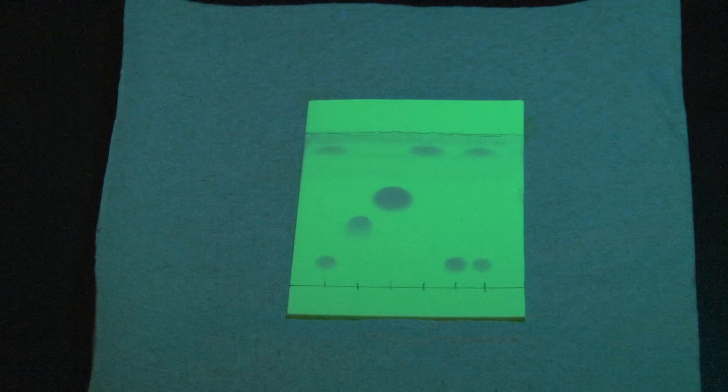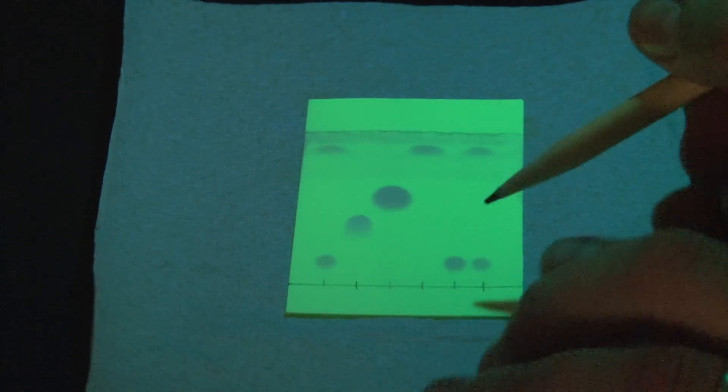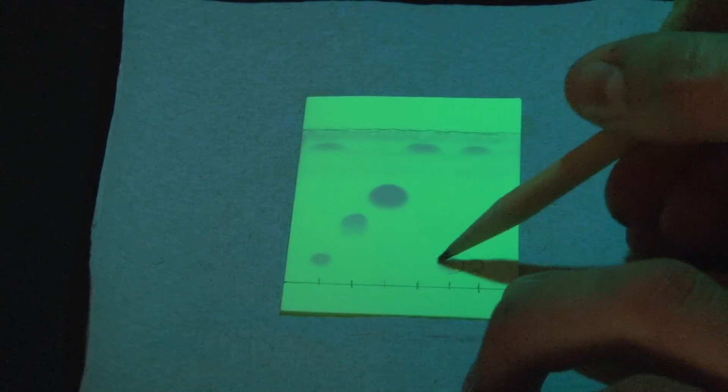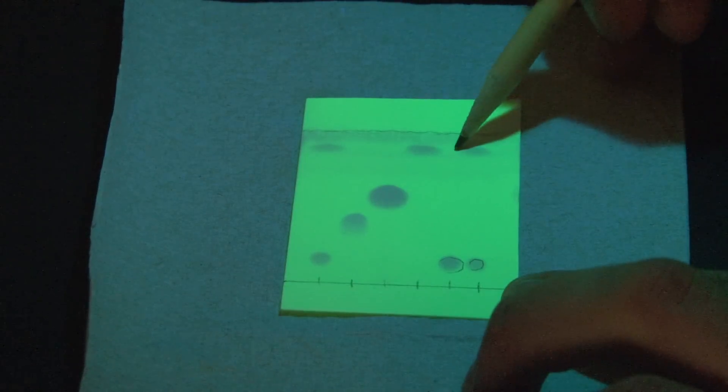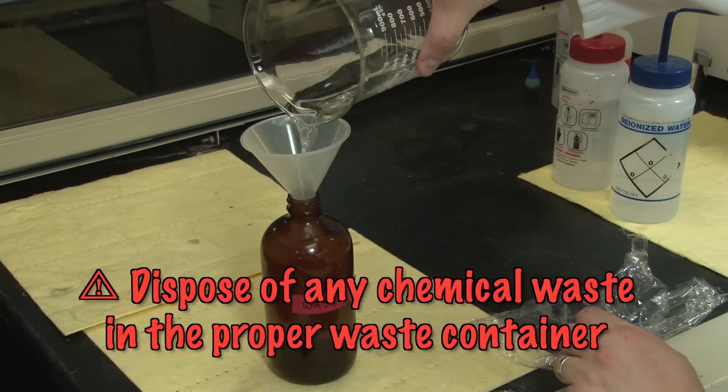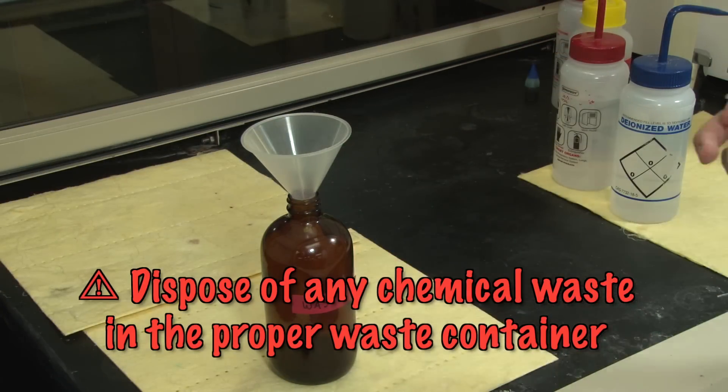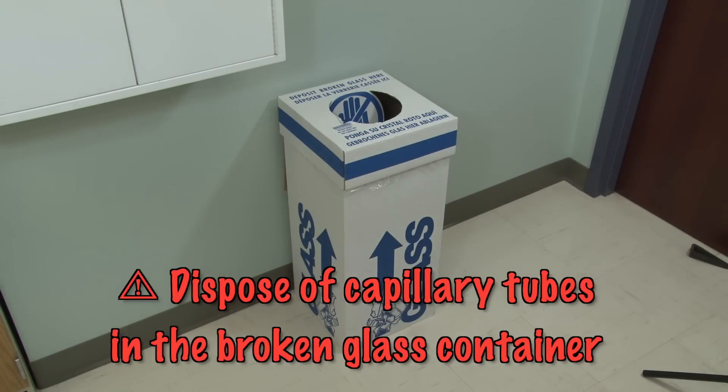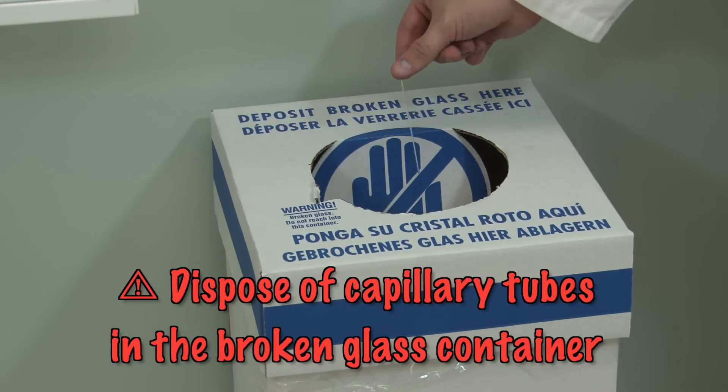Take your developed sheet and again view it under UV light. You should now be able to see how the spots migrated up the plate from their original positions. Circle them with a pencil and return to the lab. Once all the groups are finished with the known chemicals, you can dispose of all your chemicals into a waste container. Capillary tubes need to go into the designated broken glass container.